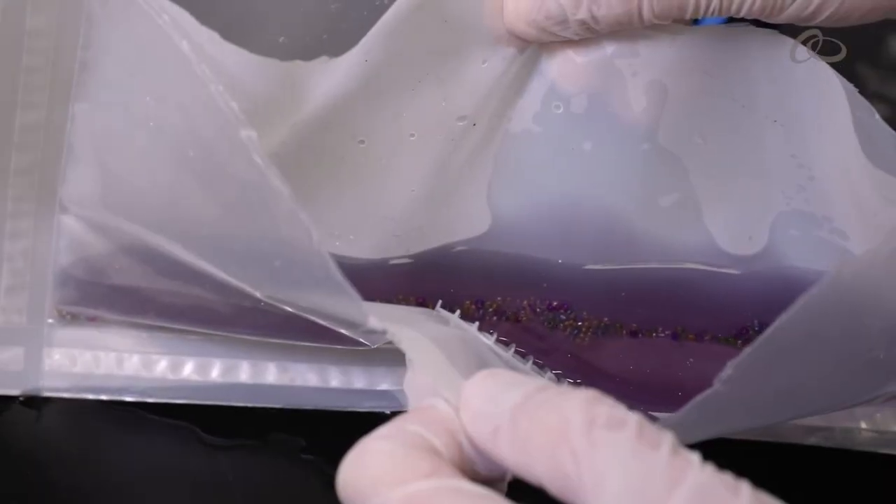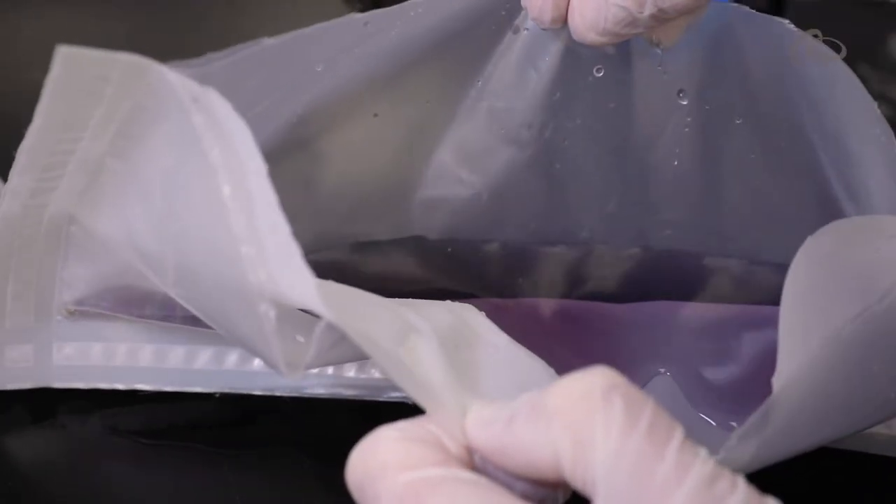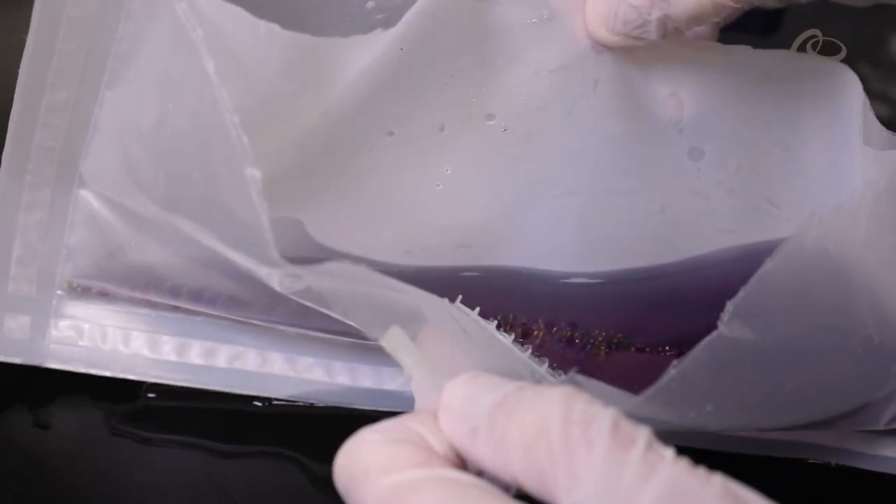We can also customize the mesh inside the bag anywhere from 10 micron up to 150 micron. The micro carrier separation bag is an economical solution because it doesn't require a filter, and by replacing your filtration step with it, it has significantly lower leachables and extractables.